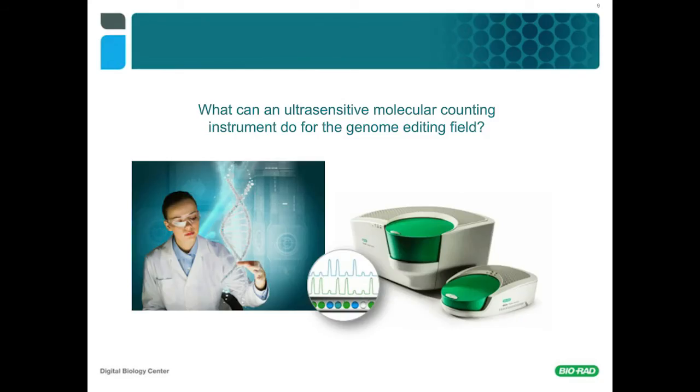So what can an ultra-sensitive molecular counting instrument do for the genome editing field? I'll spend the rest of this webinar on genome editing and how ddPCR is becoming an ideal companion technology for researchers investigating and implementing genome editing protocols.